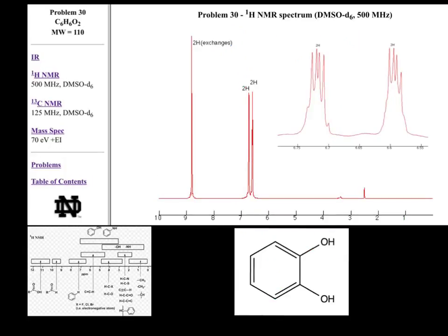Next we'll move on to proton NMR, which gives us a lot of information about hydrogen groups on our molecule. To the right is the lowest number — that is upfield — and all the way to the left is downfield. On this spectra we see three signals, indicating three different hydrogen groups experiencing different environments. Each signal also tells us how many hydrogens are in each group, and we see that each peak shows two hydrogens. Adding those up gives a total of six hydrogens, which corresponds to our molecular formula.